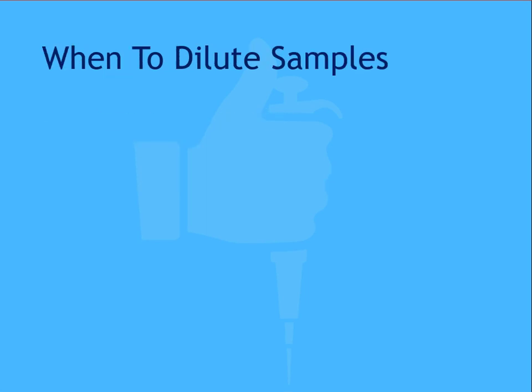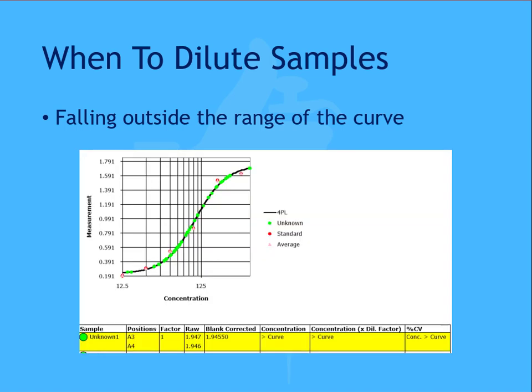Samples are often diluted for two main reasons. If the result of the unknown falls outside the range of the curve, the concentration result will be incalculable and will return a flagged result, or in this case, greater than curve limit. Note, this is a direct ELISA. If you're working with a competitive ELISA and the direction of the curve is switched, samples too concentrated may return a less-than-curve designation.